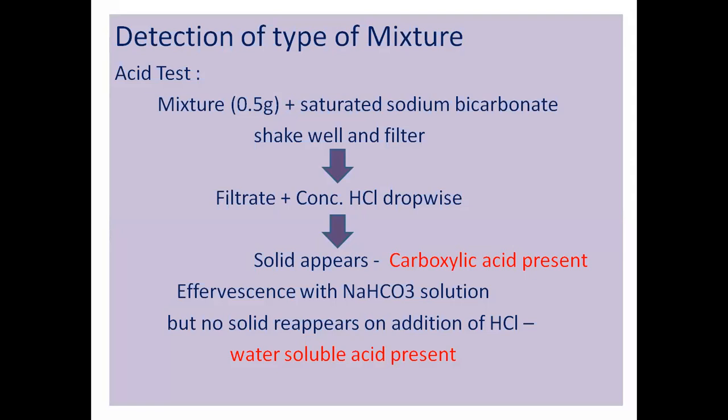If you have the water insoluble compounds, then you will start with the acid test. The compound might be a base, a neutral, or an acid. For this, first you do the water solubility test. If the water soluble compound is present, you will take the water as a separating reagent. Now, if the water soluble compound is not there, after evaporating the water you will not get any precipitate, then you do the acid, base tests.